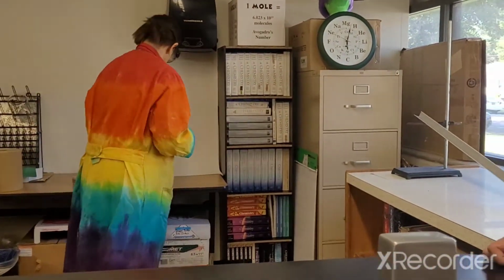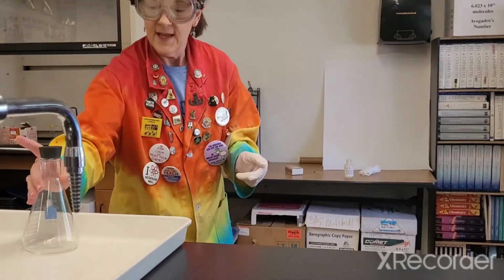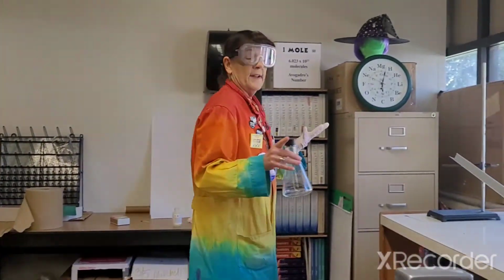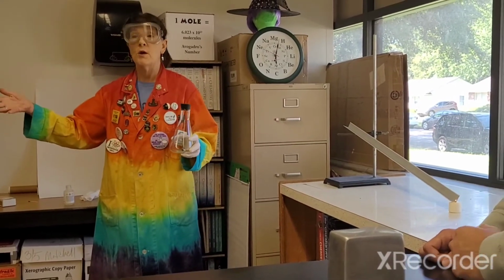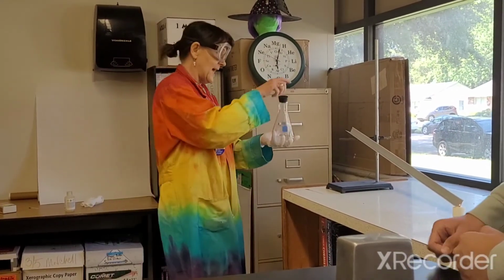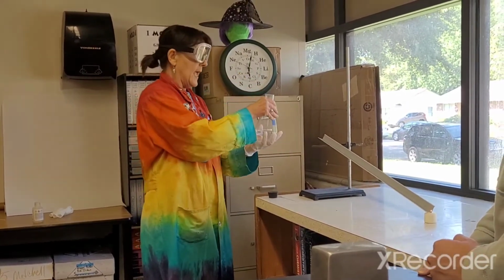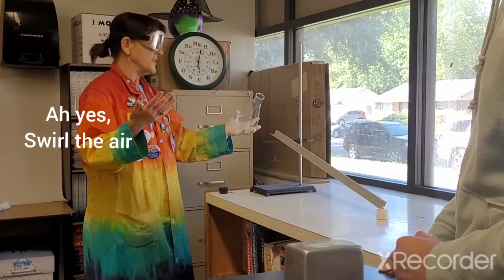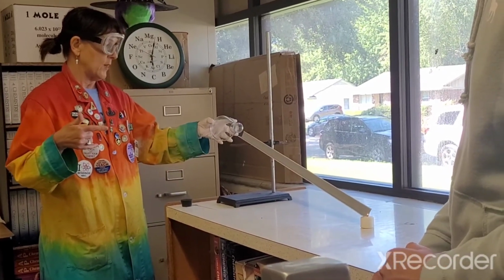Okay. So, all right, fingers crossed, ladies and gentlemen. It's worked so far in every class. I hope it works in this one. If it don't, don't judge. Part of science is failure, right? So it does happen sometimes. So I'm just going to take this off. I'm going to swirl it one more time. And it's going to look like nothing's happening because I'm not going to let the liquid get to it. I just want to see if I can make the vapor go down the ramp.